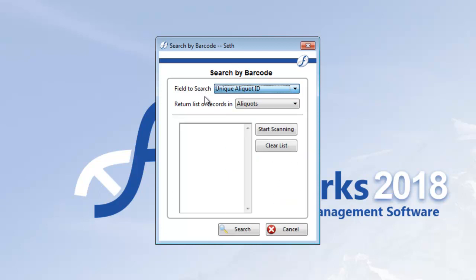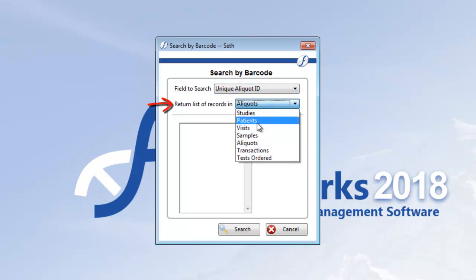This next part is pretty cool. So I have a bunch of vials to scan, but I actually want to see the patients that those aliquots belong to. To do this, I'll change the return list of records in drop-down to patients.